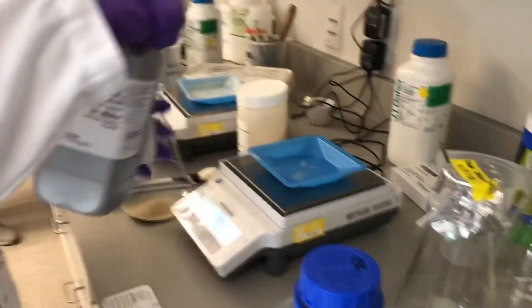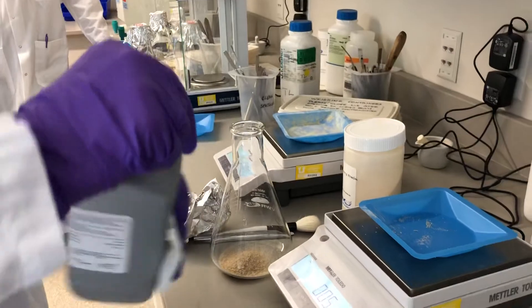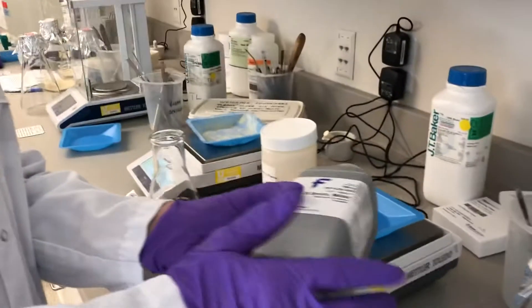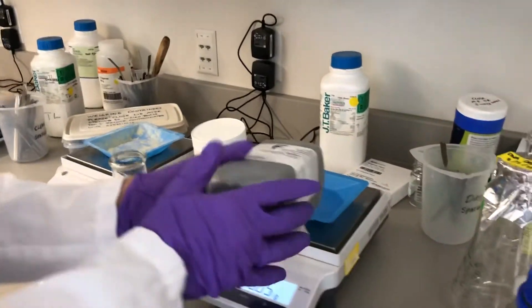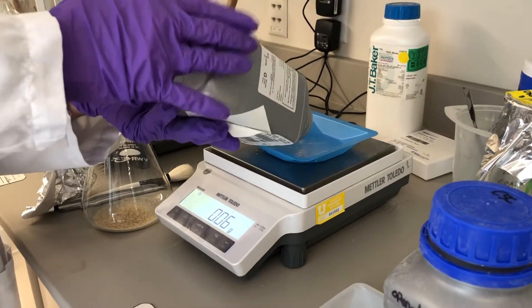The next ingredient is LB broth, and here you want twelve and a half grams. If you overshoot by a gram, that's okay. This is a little bit fluffier, lighter, so pour more gently. Avoid breathing in the dust.